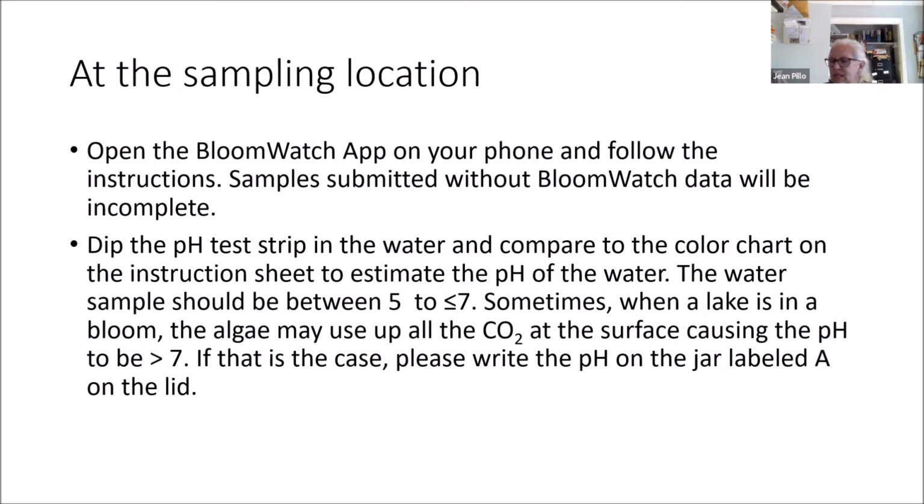I know that in some places I've gone to lakes and I was unable to upload the pictures on the water because lakes are kind of at the bottom of a hill typically. So you can get the pictures and you can get the GPS point usually okay, but you may have to go someplace else where you have a better signal to be able to send the data in.